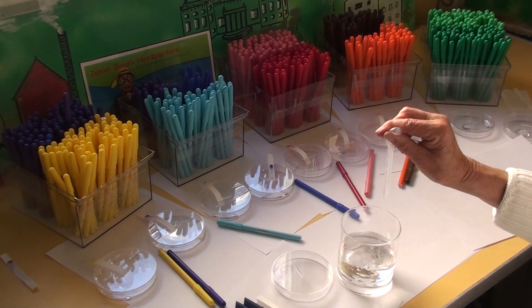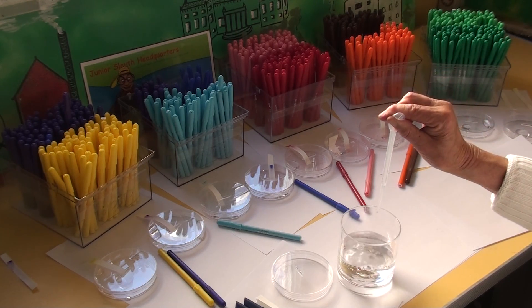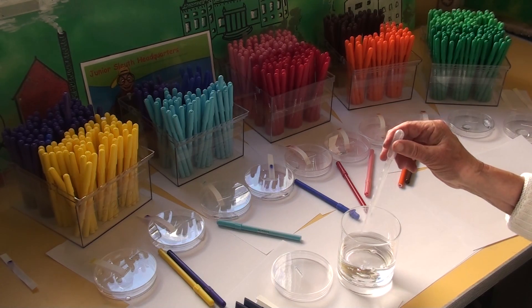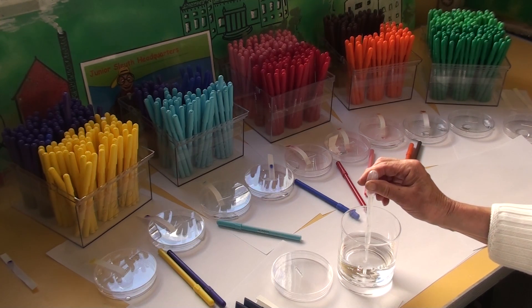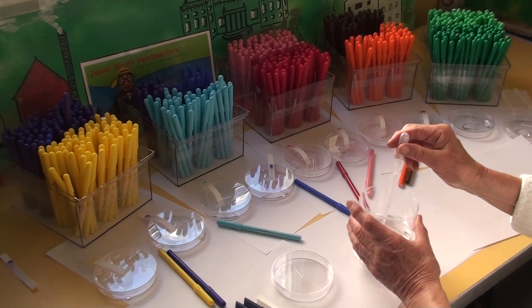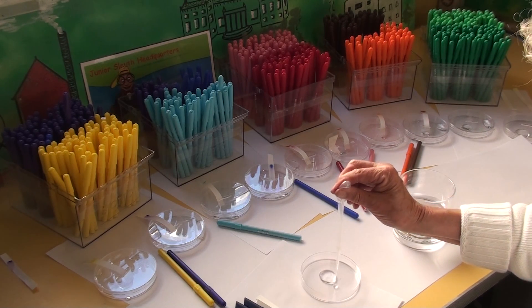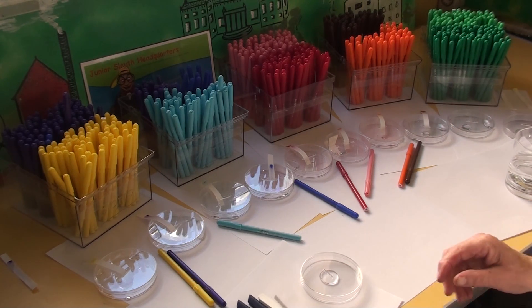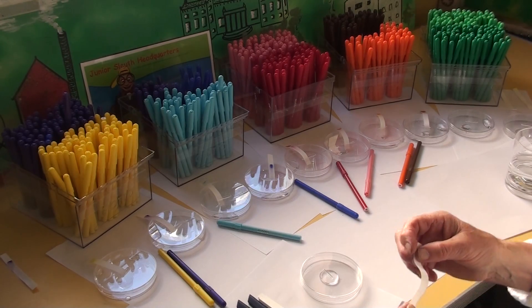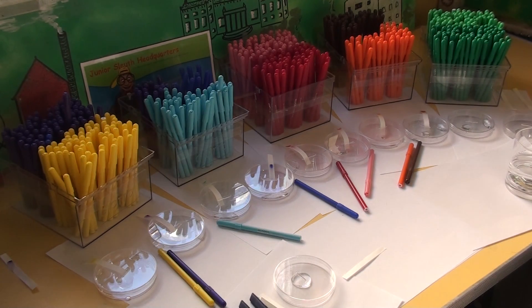Squeeze it out again, get rid of it, try that at least three times until you can get it nearly to the top. Squeeze it out again, try it again — right up to the top. You'll probably get a few children who squeeze it out all over each other, but it's just water. Then pull it up, take the lid off the dish, squeeze the water into the middle of the dish, and put the lid on again. Then you take a piece of paper — it's special paper, it's called chromatography paper.